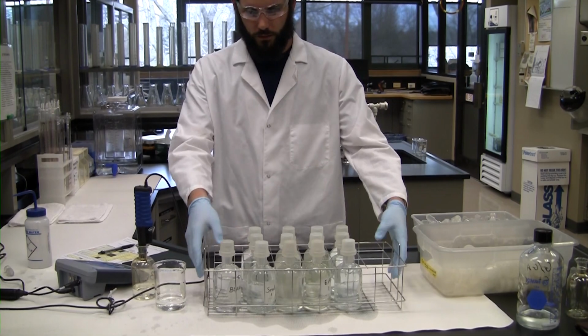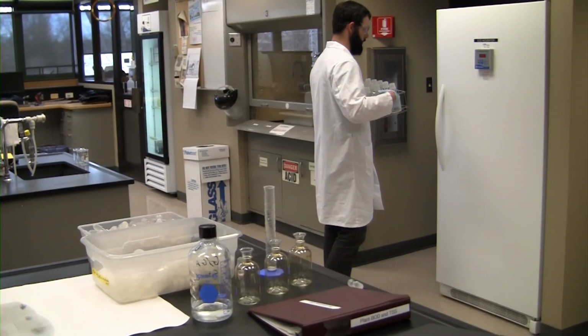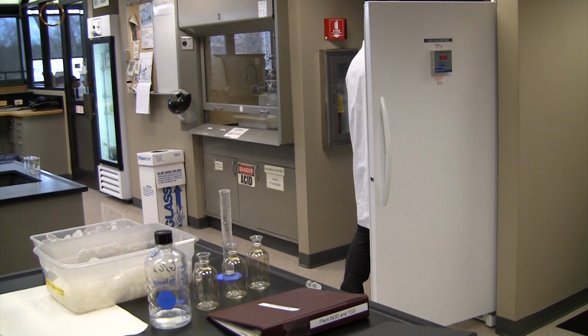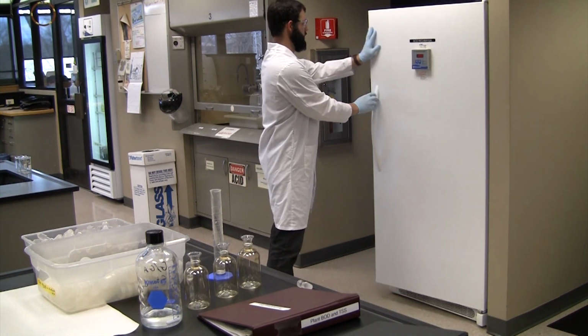Once all of the bottles have had their initial DO read out and were stoppered and capped, place them in a 20 degrees Celsius plus or minus 1 degree incubator. The samples will be stored for 5 days plus or minus 6 hours. Check the incubator temperature each day. If you do not have an incubator, place the samples in a dark room that has relatively consistent temperatures.